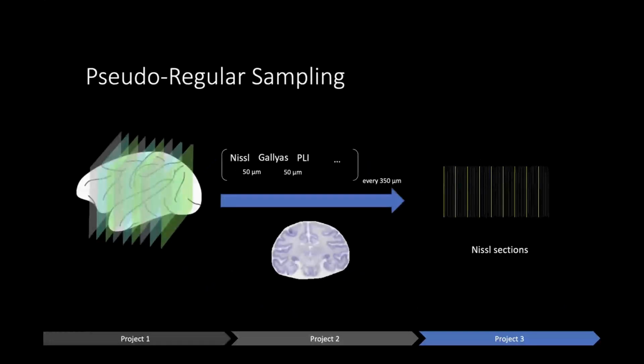So the little caveat that I was mentioning, which makes this different from the BigBrain project, is the way of sampling. We tried to future-proof our dataset, and we designated 7 samples to be taken to constitute one block, and that had a thickness of 350 microns. After that 350 microns, another 7 sections would be sampled, but only the first 3 of those 7 sections would be used at the present time, and the remaining 4 sections would be kept for future use, whatever researchers in the future might be interested in.